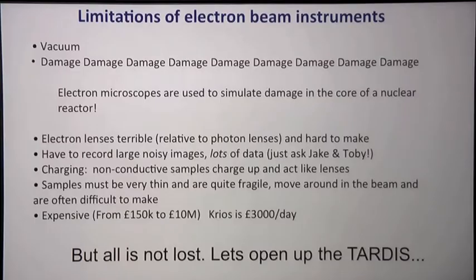But not only that, even worse for us, your sample has to go into vacuum. And as you all know, biology doesn't happen in a vacuum. It happens in air or in water. And so you have to make your samples compatible with this. And a big part of the development that Tony talked about on Monday in electron microscopy has been actually figuring out how to get samples into this weird place that is the inside of an electron microscope.